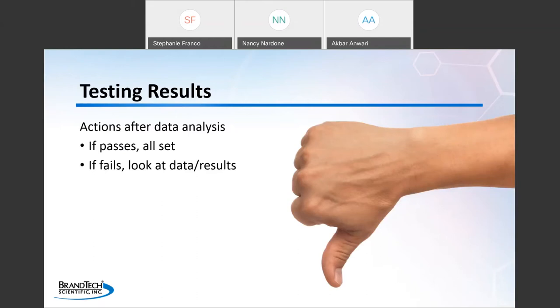This is another reason why it's important to test at more than one volume. It helps to see what the results are at all of the volumes tested. A test result at a single volume simply doesn't provide enough information.